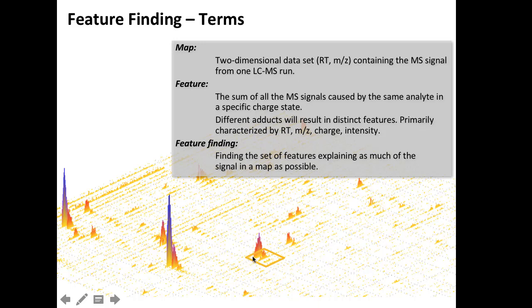So here you see there is an isotope profile. In this case, it's probably about 100 different peaks in these mass spectra. Which of these dimensions is M over Z and which is retention time? Well, you see the peaks have a Gaussian profile along this dimension. So here, going from left to right, that's retention time. And this is M over Z, and you can recognize that because here you have the isotope profiles that you've seen yesterday. So basically, we have 100 peaks or so that come from the monoisotopic mass, from the +1 and the +2. And they have both more or less Gaussian elution profiles.